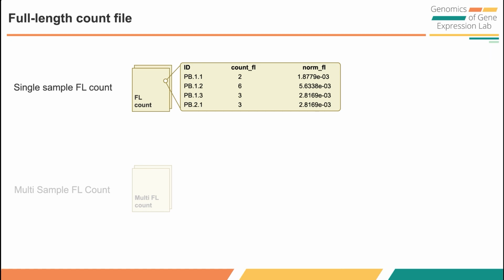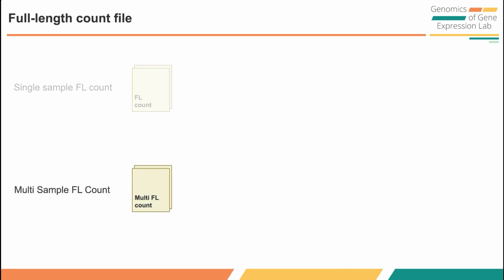The next one is the multi-sample chained full-length count file, which is produced by Cupcake and will have the following format.